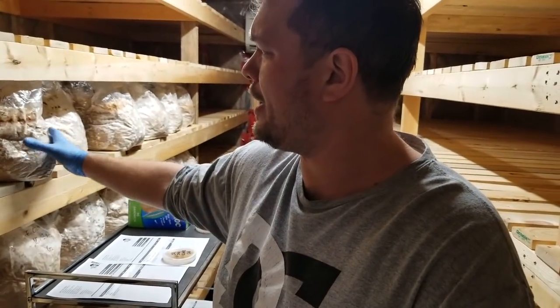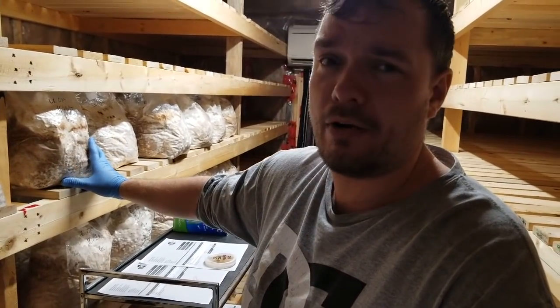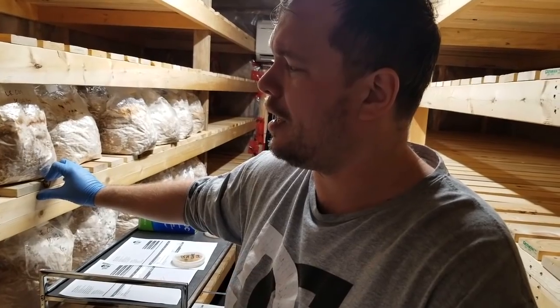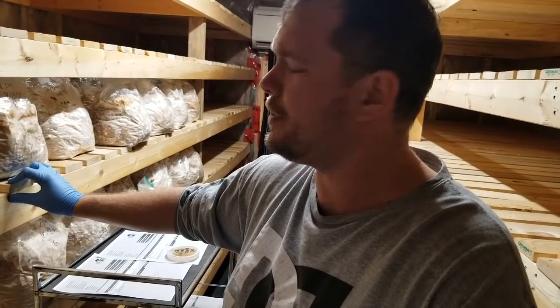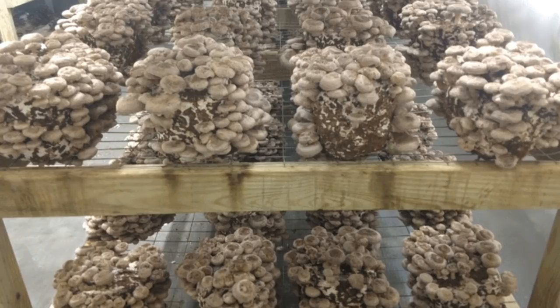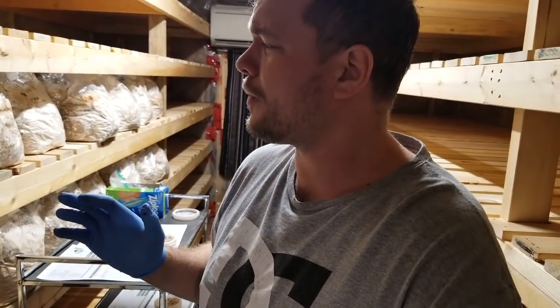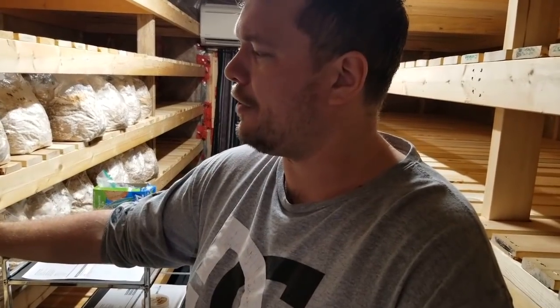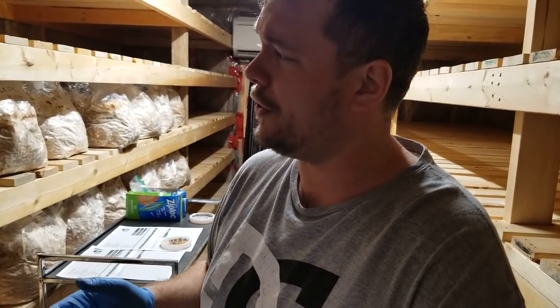I have a shiitake run right now. This is all done on sawdust. So I have more than I need. We're going to be playing around with some shiitake at the beginning of April and these will be going in the greenhouse. This is all strain 3782. If you've been talking to TR Davis, he likes to grow 3790 — I don't have that strain yet. I actually haven't grown shiitake for about three years now, and I'm kind of interested to play around with it again. I'm doing some 10-pound blocks and those are in the sterilizer. We'll be expanding this spawn out probably in a few days.